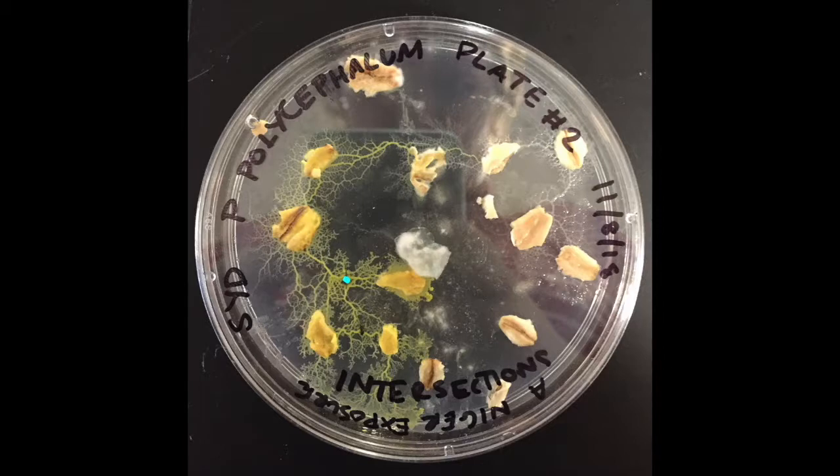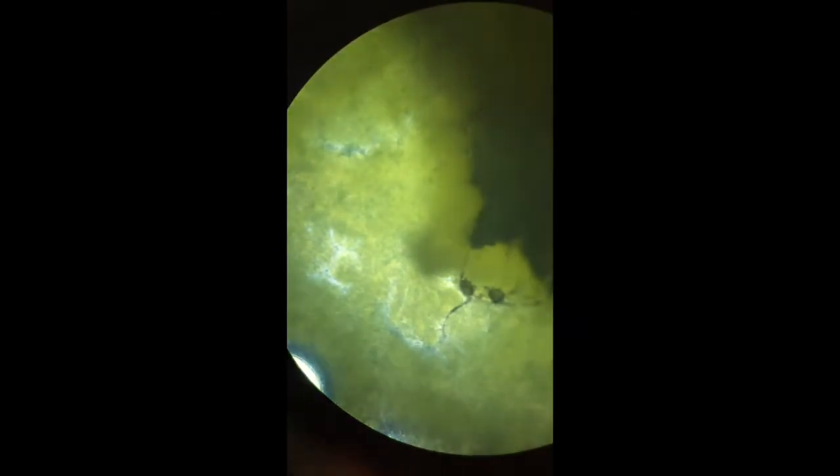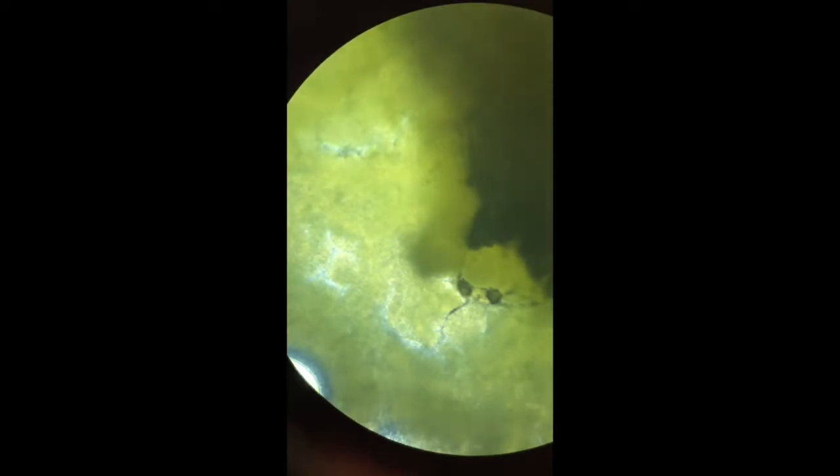Plate two is the intersections plate. Here I plated Aniger in a web of slime mold. Looking at the top one at hour zero, we can see the cytoplasmic flows just kind of carrying on as usual.